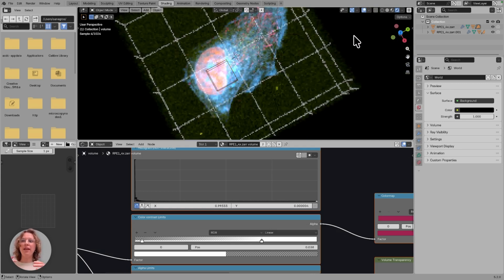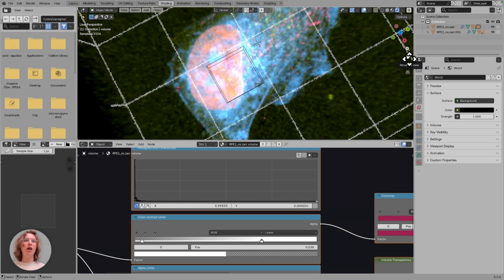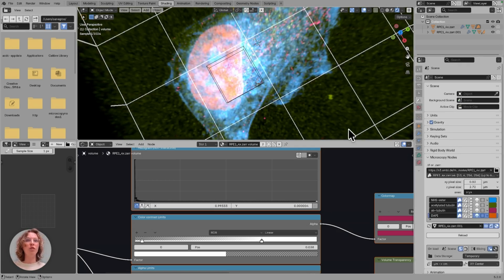So in this way, we can take small regions of a data set either by very flexible masking, so we can do something with a complicated shape we can also select, but we can also just crop a box and say, let's reload this box, and still have all of our data that's around it still being visualized at a different scale. And all of this is extremely editable, even if it is slightly manual to set up. Once we have this set up, we can actually just use this. So I hope this helped for learning how to interact with large data.